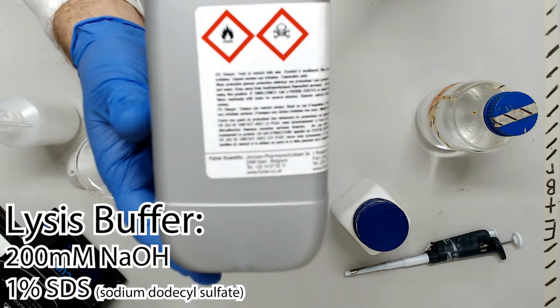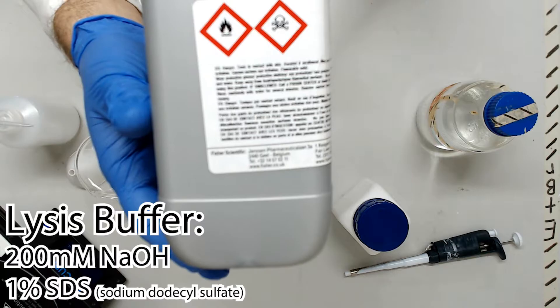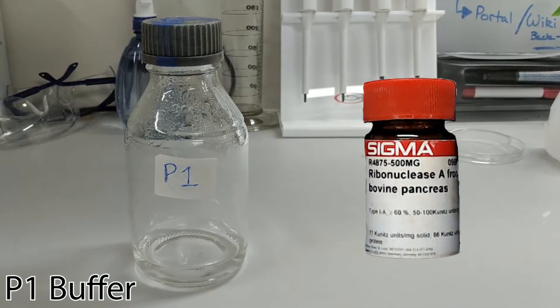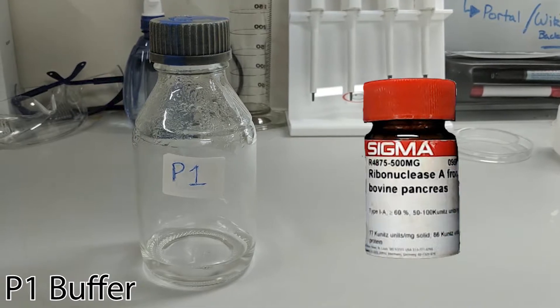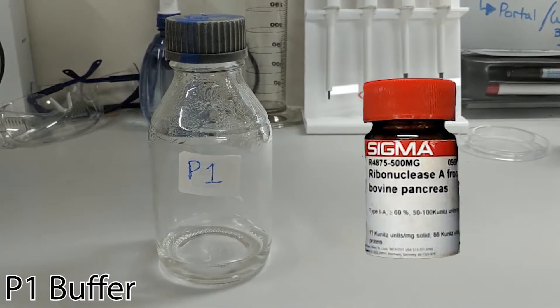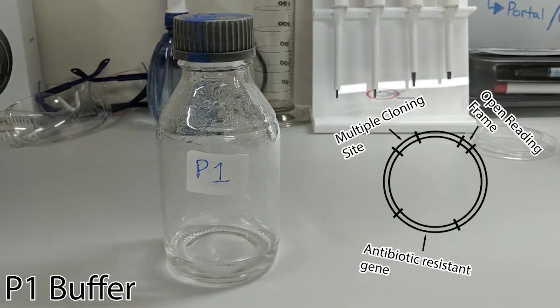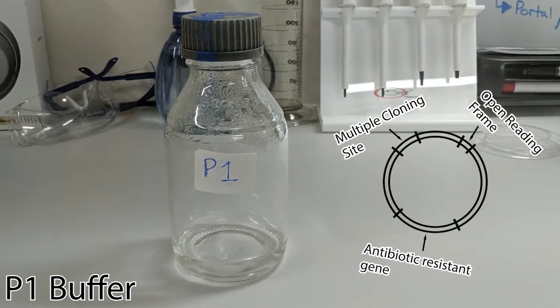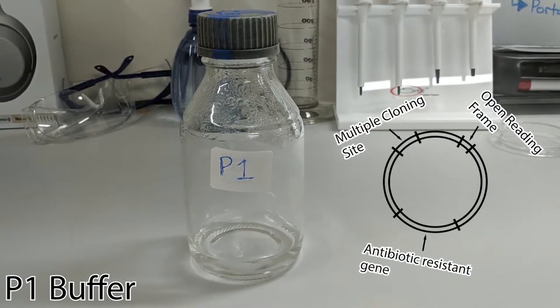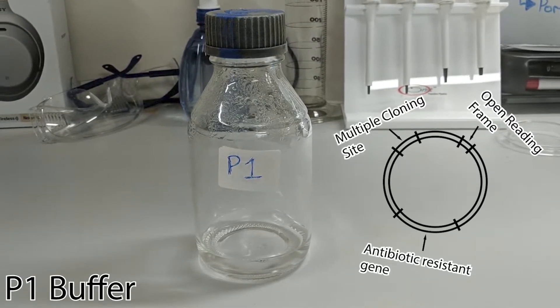When we use this buffer to lyse ourselves we are going to walk a delicate line. We must give sufficient time for the RNases in buffer P1 to do its dirty work cutting up all the RNA released by ourselves. However, leave the reaction too long and the mixture of intact proteases, detergent and sodium hydroxide will start to damage our plasmid DNA. Even shaking too vigorously while using this buffer can result in the shearing of plasmid DNA.